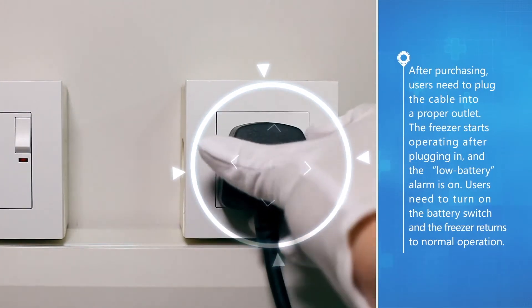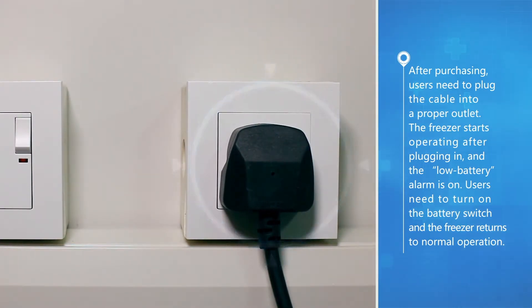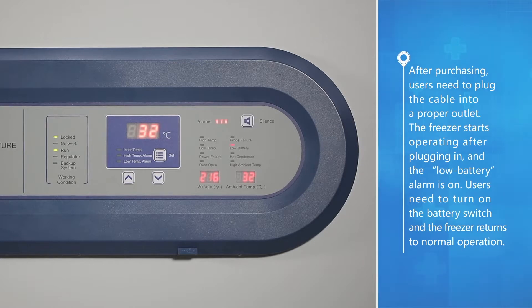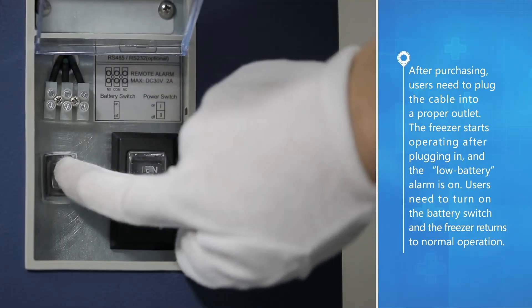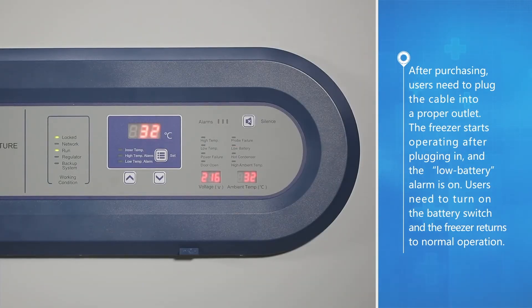After purchasing, users need to plug the cable into a proper outlet. The freezer starts operating after plugging in and the low battery alarm is on. Users need to turn on the battery switch and the freezer returns to normal operation.